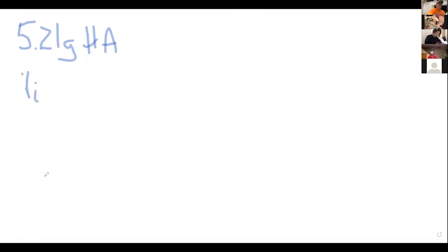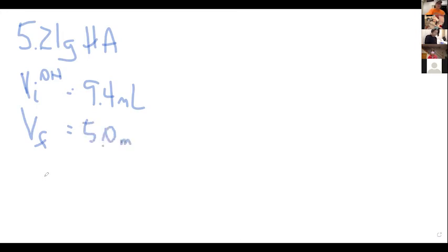All right, so I had 5.21 grams of acetic acid. My initial volume of hydroxide was 9.4 mils. My final volume was 5 mils. So I delivered 4.4 mils.